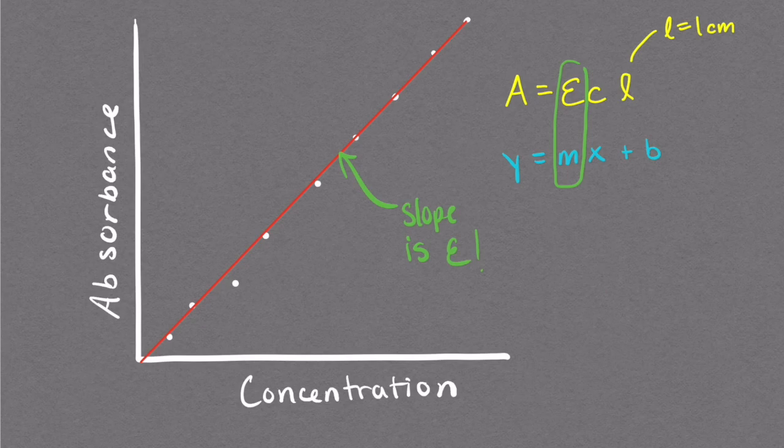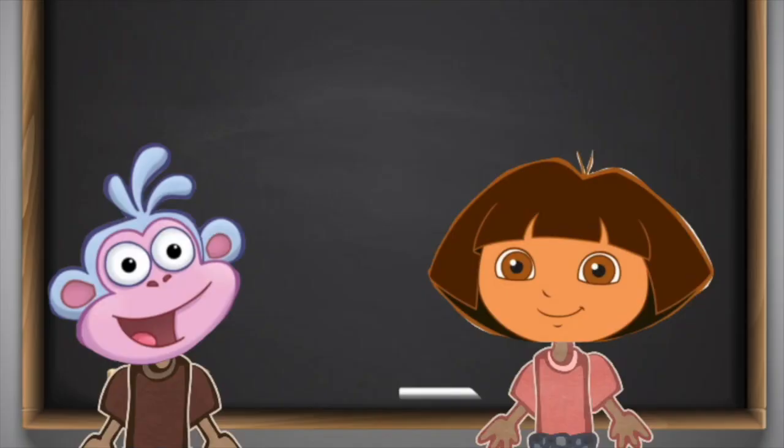Gee, all that information from some trials on a spectrometer? That's not even all. How much more is there? There's so much more. What we did is analytical spectroscopy. We used visible light from about 400 to 700 nanometers, but you can use any electromagnetic radiation.